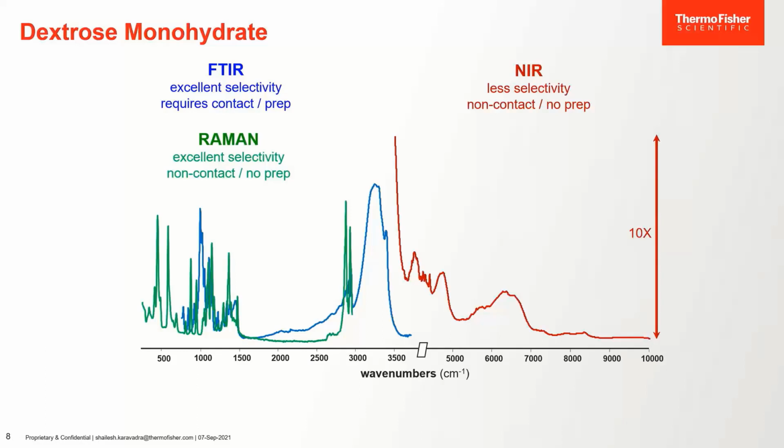Raman and FTIR spectroscopy differ in some key fundamental ways. Raman spectroscopy depends on a change in polarizability of a molecule, whereas IR spectroscopy depends on a change in the dipole moment. Raman measures relative frequencies at which a sample scatters radiation, unlike IR spectroscopy, which measures absolute frequencies at which a sample absorbs radiation.